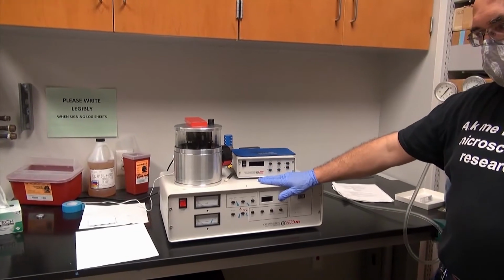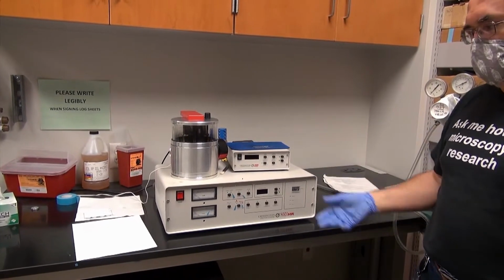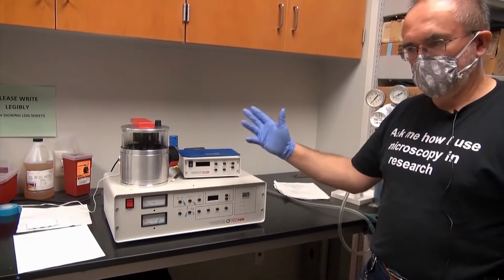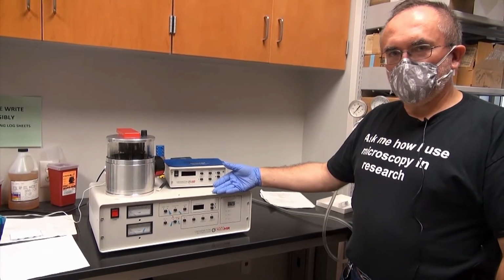Another coater is used for higher resolution coating, so it's equipped with a different target, platinum palladium currently, and it also allows us to use higher vacuum for the coating. And that's typically used in conjunction with our Quanta field emission SEM.